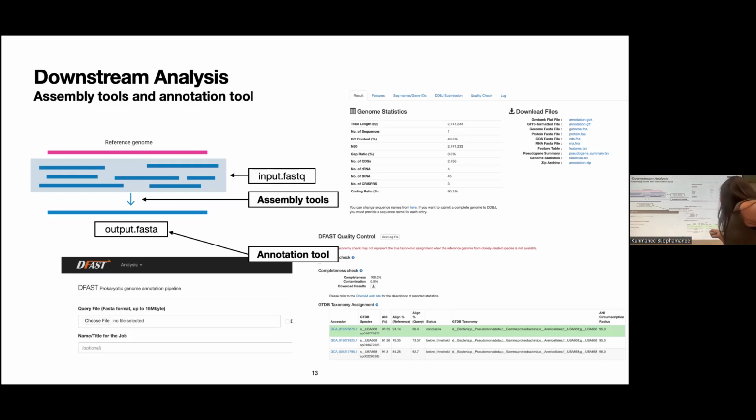And if I'm lucky, it will give me the name of who it is based on the database that it has. Most of the time it gives it nicely, but sometimes when my DNA is not clean, it's fragmented, it just gives a bunch of names that we're not sure about. So yeah, that is all the hands-on experiment work that I've done.